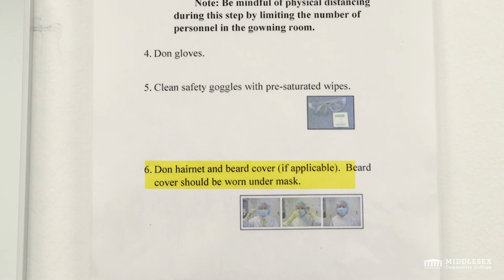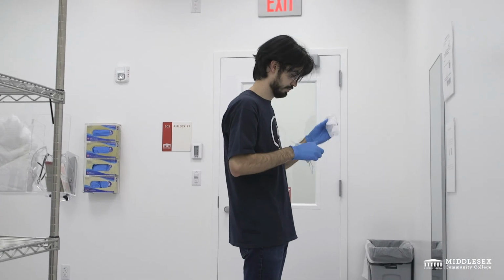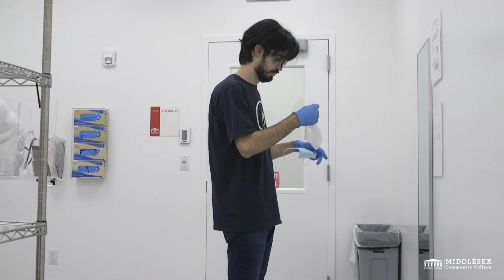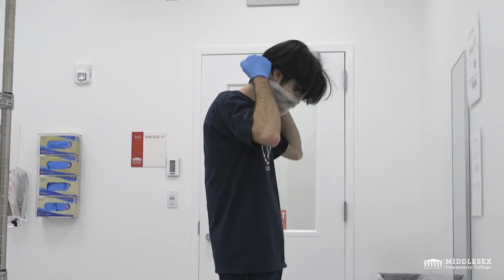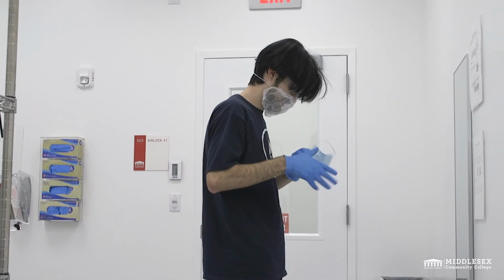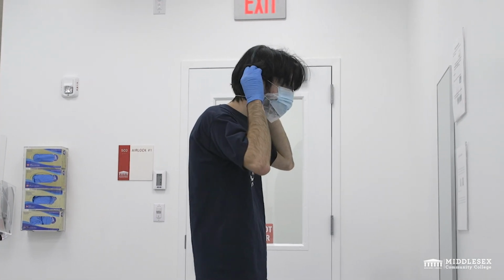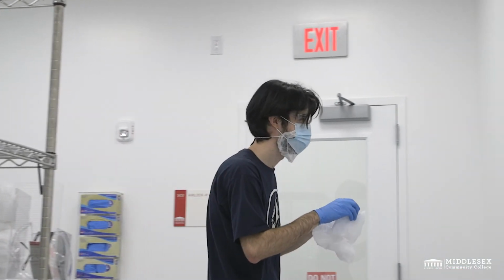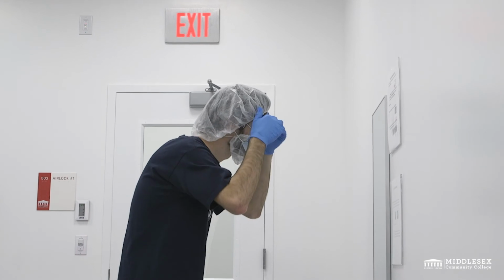Next, you're required to don your hairnet and beard cover if applicable. Beard covers should be worn underneath your face mask. Using the mirror provided, please make sure that all hair is tucked inside of the hairnet.